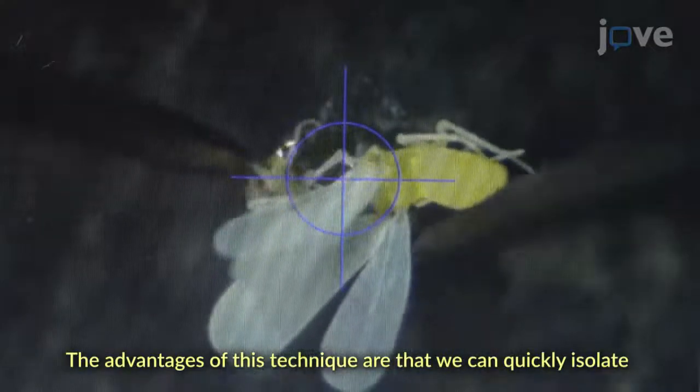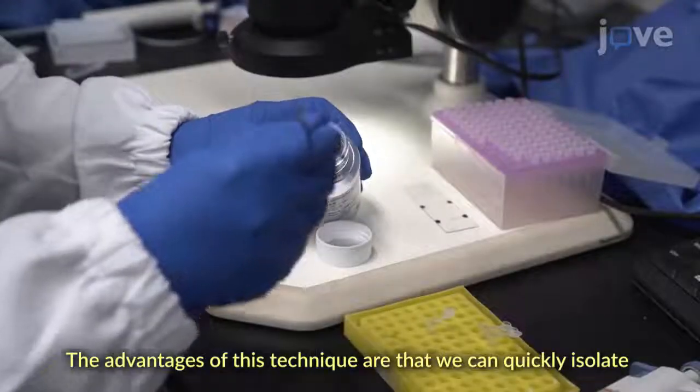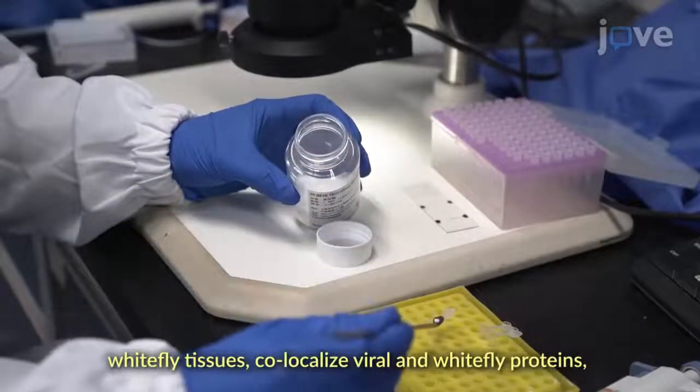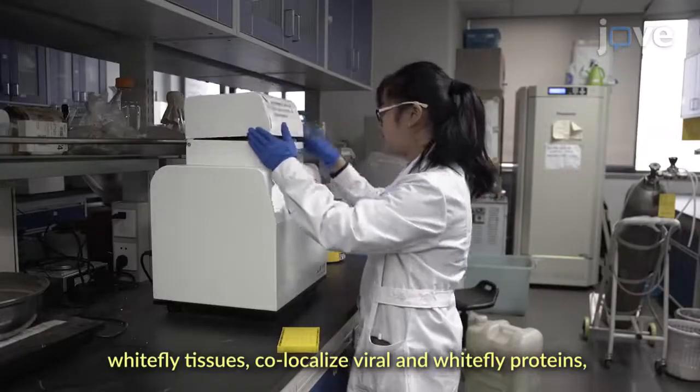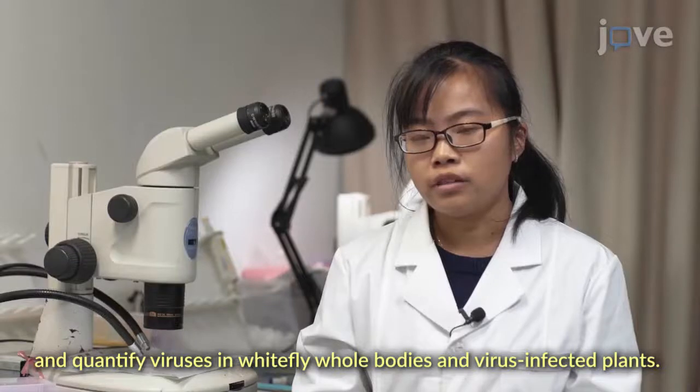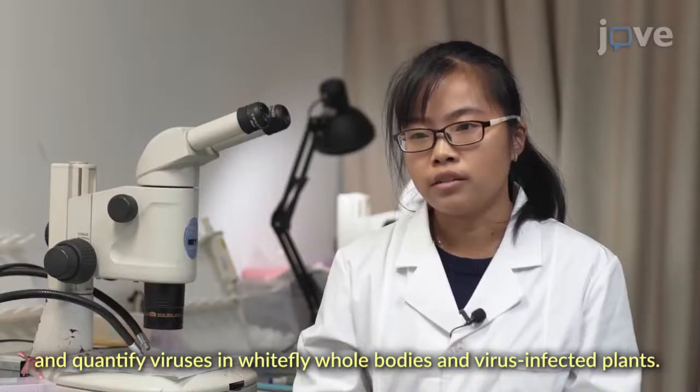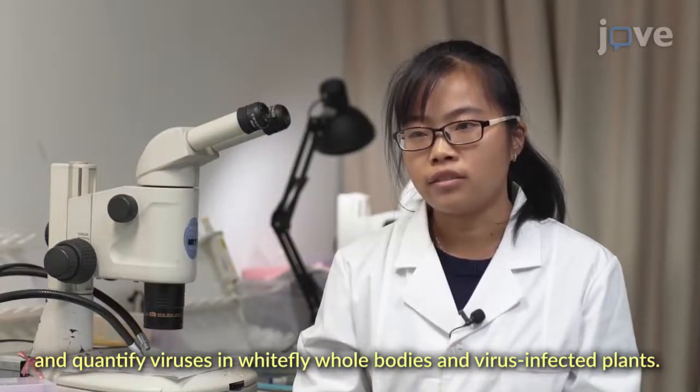The advantages of this technique are that we can quickly isolate whitefly tissues, colocalize virus and whitefly protein, and quantify viruses in whitefly whole bodies and virus-infected plants.